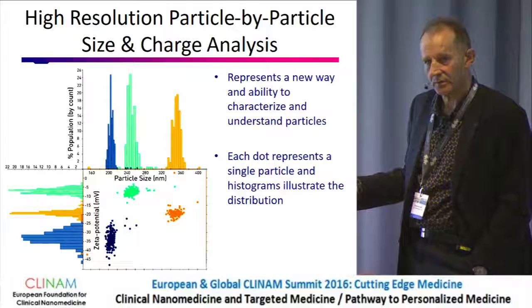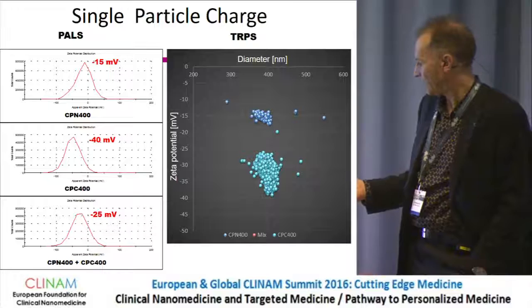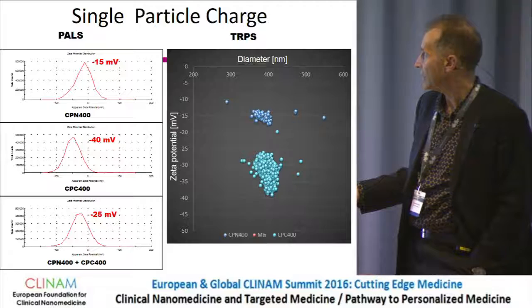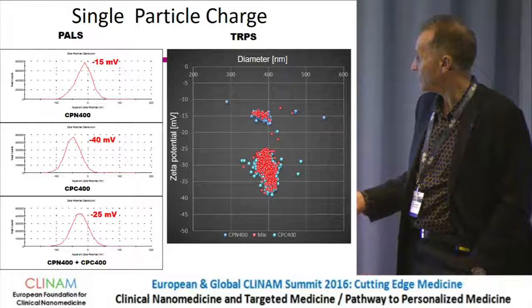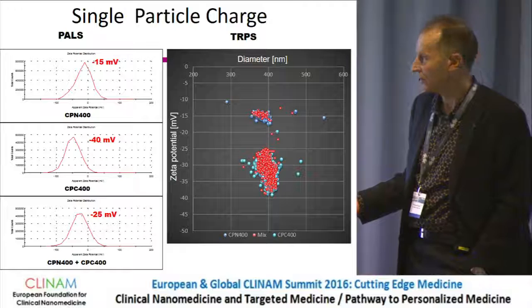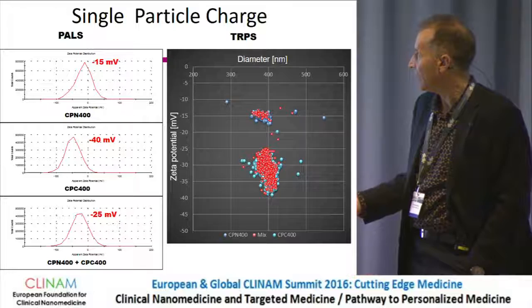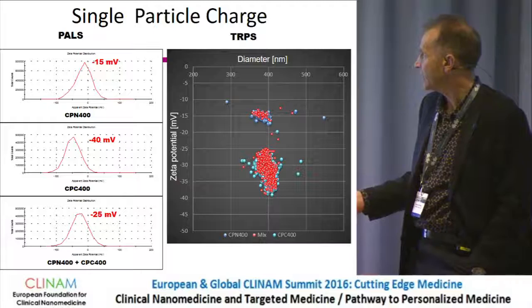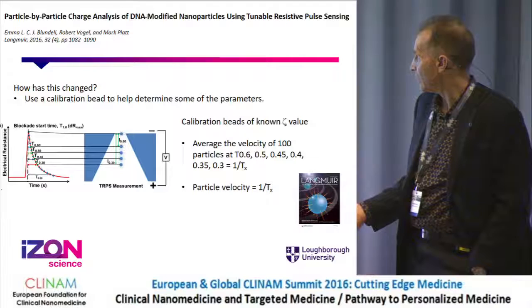This is a plot of zeta potential versus size — quite simple — and you can actually do that in three dimensions to get number as well. This shows what happens if you measure two particle sets mixed together. Measured individually, and then with PALS or DLS, you get a single number which varies depending on the nature, concentration, and size of the particles — not just the charge. So DLS becomes an unreliable method of measuring charge, whereas with TRPS you can separate the particles out one by one.